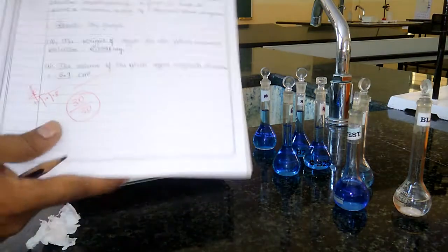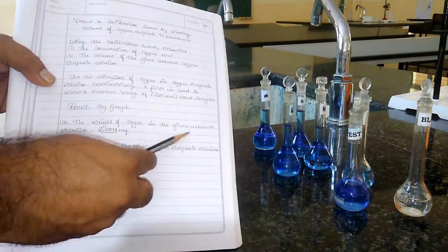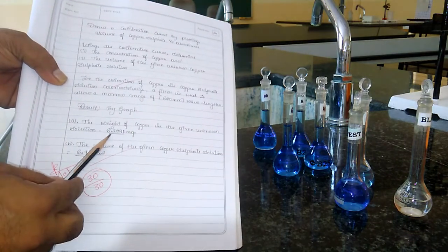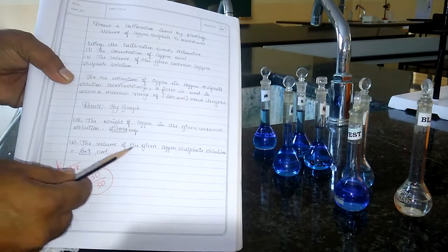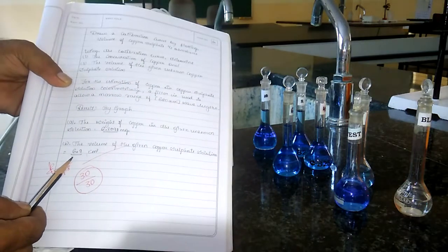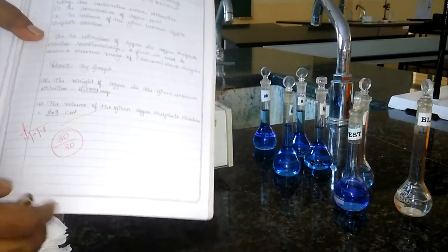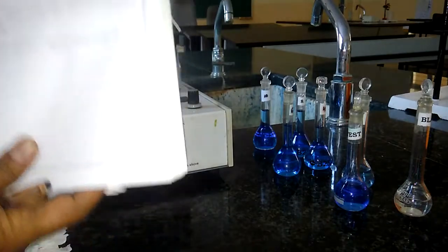At the end, we write the result: the weight of copper in the given unknown copper sulfate is 6.2098. Similarly, the volume of the given copper sulfate solution from the graph is 6.1 ml. This is how we write the result and how we perform the colorimetric estimation of copper.